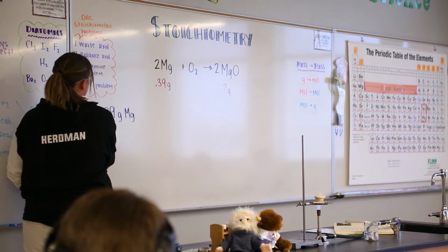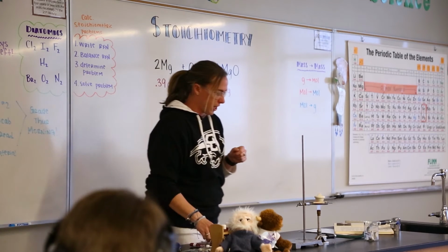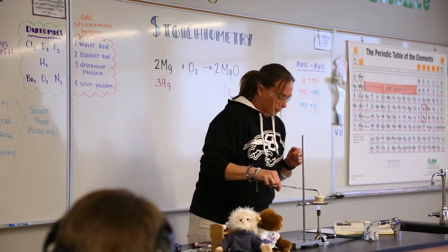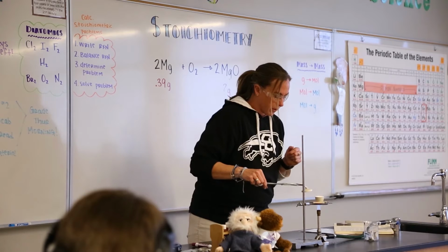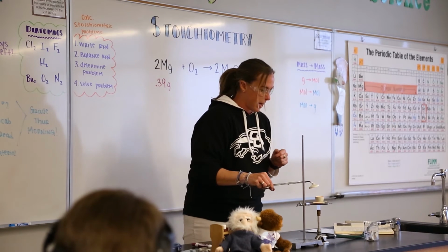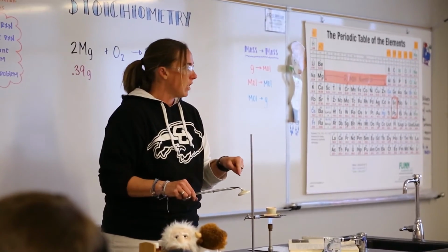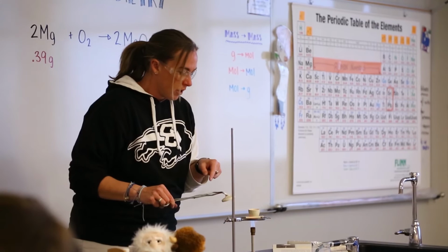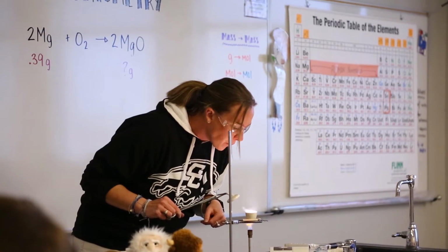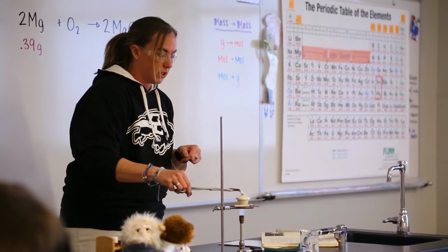Yeah? So I'm going to write this down now that we have it written. Okay, let's check here. Make sure we're doing okay. All right, you guys see the flashes? Yeah. All right, that's it, lighting on fire. I'm going to blow a little bit into it. Why do I need to blow into it? Oxygen, because we need the oxygen, right? Yes. All right, so we'll add a little bit of oxygen into it.